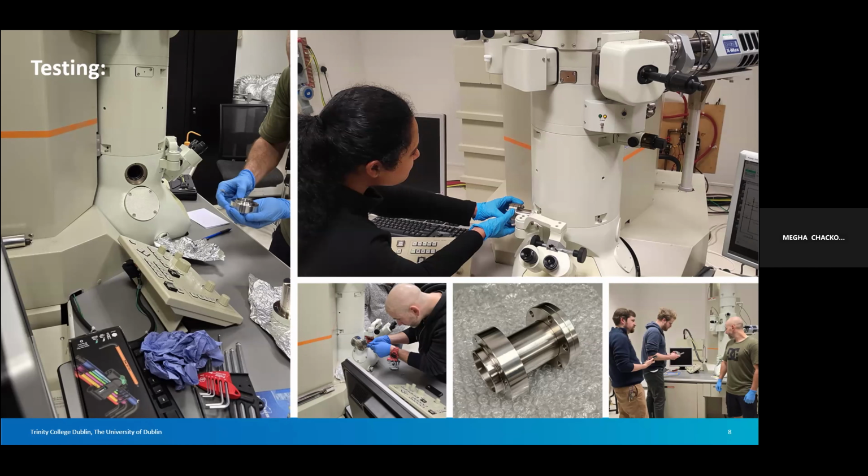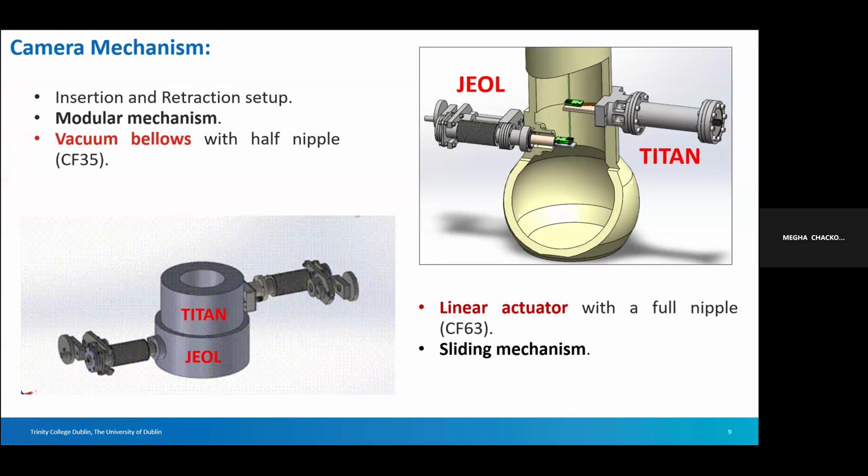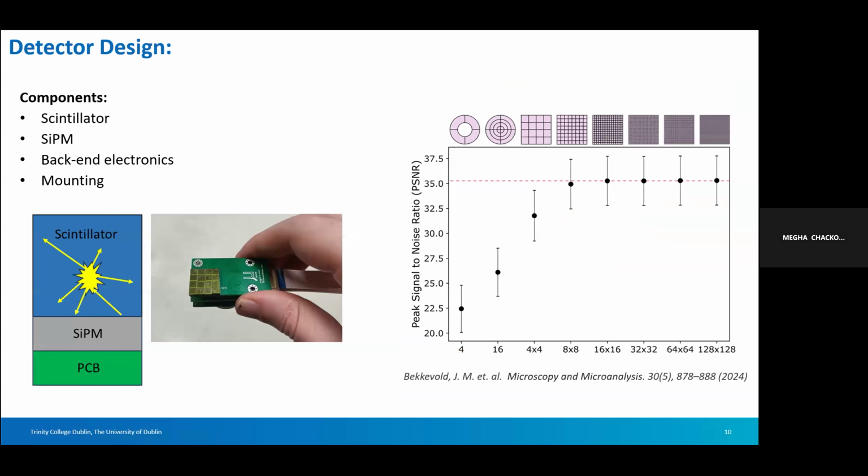The next part is testing, the most important part, where we have to make sure the vacuum condition is safe enough with these flanges. We have tested our machined flanges on the JEOL microscopes, and it is safe enough to go. As I have talked about the low cost, I'm also introducing a new insertion and retraction setup. If you have to use EELS spectroscopy or other detections while you are using the STEM, you can insert and retract the detector setup with a bellows or a full nipple design on these CF standard flanges.